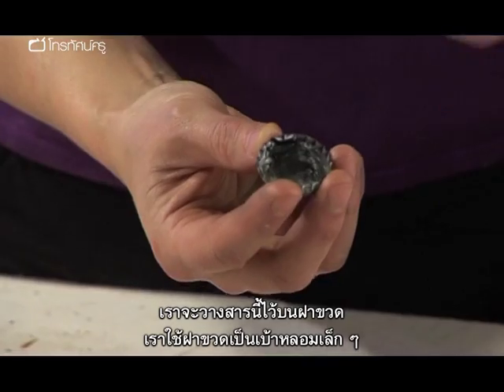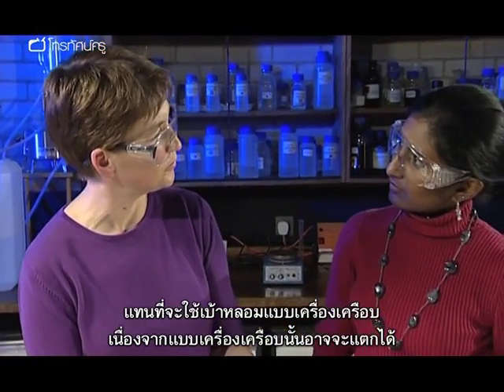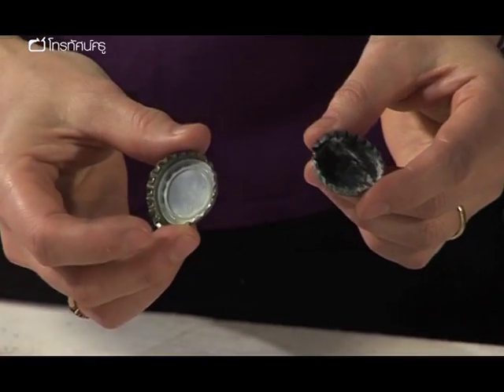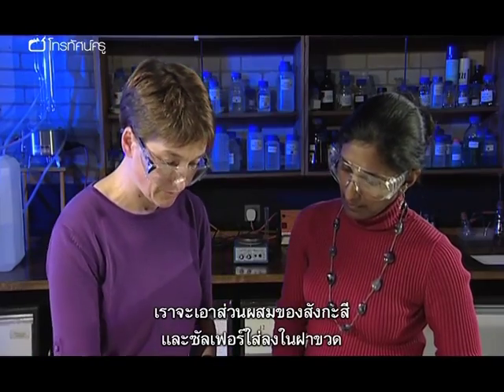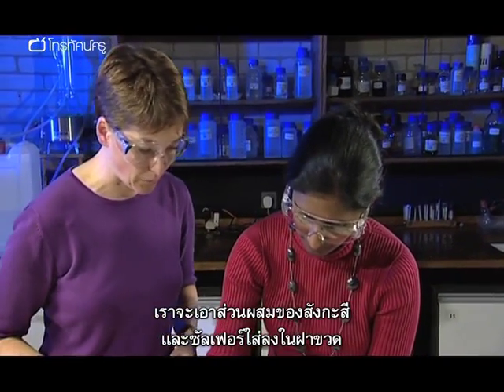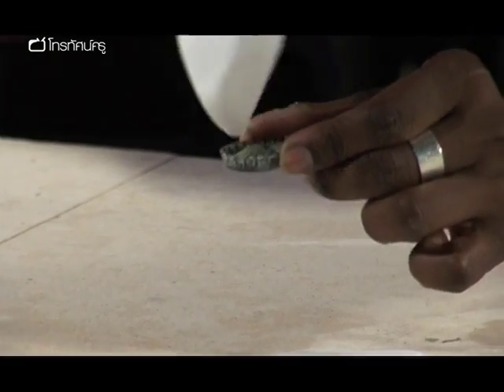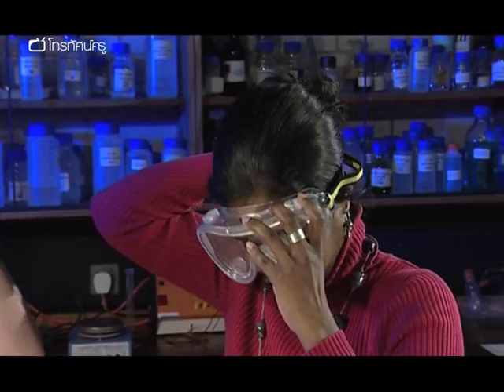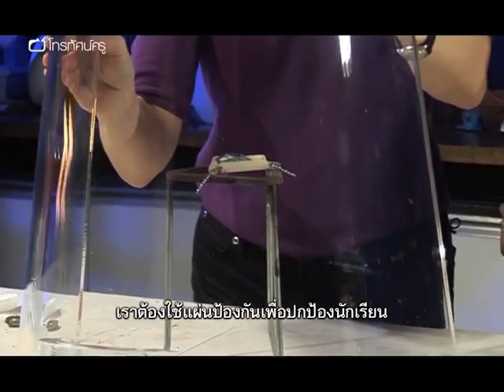We're going to use a bottle top as our little crucible rather than a porcelain crucible, because porcelain crucibles can crack. The only thing you've got to remember is obviously bottle tops come with a plastic insert, so you have to burn that out before you use it. So we're just going to transfer the zinc and sulfur mix into the bottle top, and we also need a screen to protect the pupils.